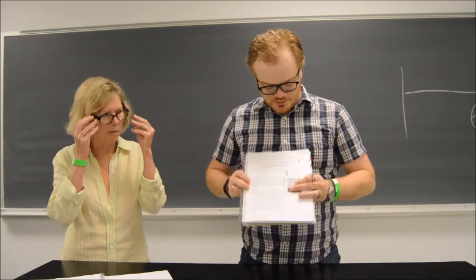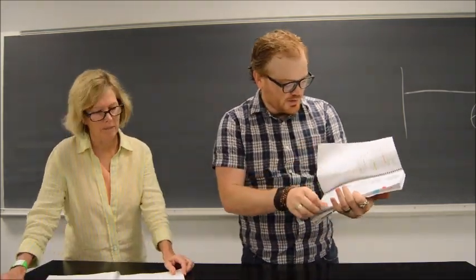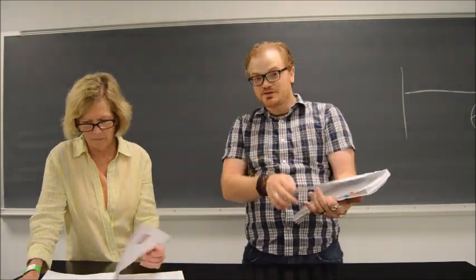Absolutely. All right. So here we are. We're going to do Macromolecules Laboratory number 2. So I've got writing all over this thing, just to kind of keep me where I want to be. You should have your lab book out and be making notes as well. It'll make your life much, much easier.